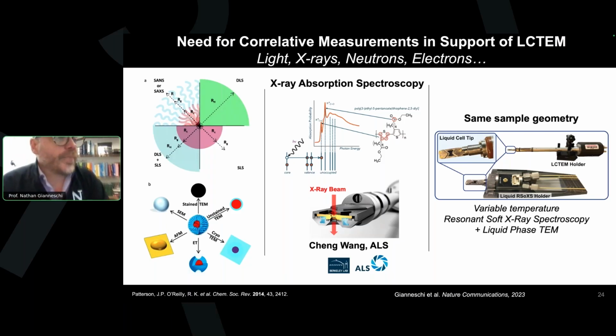But in lieu of that kind of multi-million-dollar experiment, this was a demonstration of our ability to examine phase transitions that were temperature induced, where we could pin it down by two completely different methods, and then tease out where we had electron damage, or rather where we were imaging within a safe regime by correlating the X-ray result with the electron microscopy result.